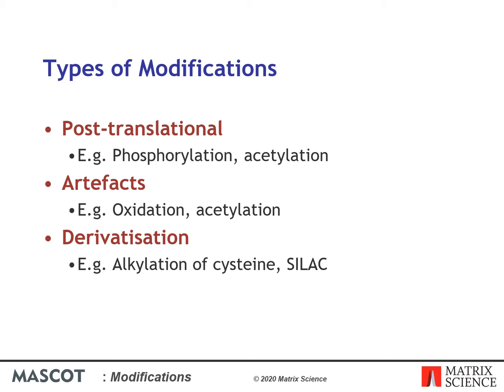During the database search, modifications can be handled in two ways. Fixed modifications are where every instance of the target residue is modified. These are simple to handle because it is effectively just a change in the mass of the residue. The more complex case is variable modifications, where just a limited number of the residues are modified. In this presentation, we'll be looking at some very important changes in how Mascot permutates the possible arrangements for variable modifications during a database search.